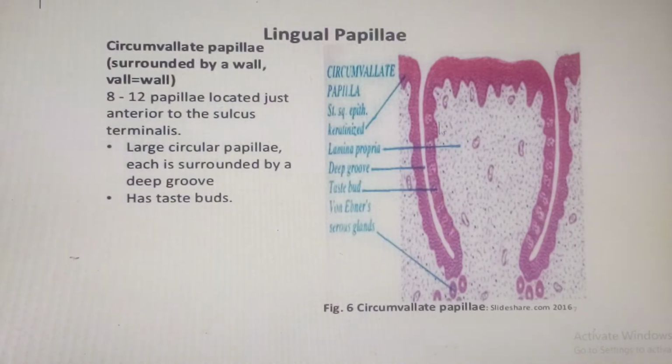Now, some people may describe this one as being mushroom shaped. Although I'm not talking about fungiform papillae, you can take it like that. But one thing I want you to know is that the epithelial pegs that you find over here are shallower, or less long, and the connective tissue papillae which invade are also less deep, so to speak. But the striking thing is that we have taste buds on the lateral wall of the circumvallate papillae. That is the identifying feature of this one that you have to know. Very simple in that regard.